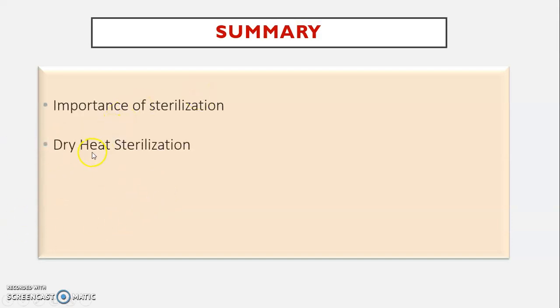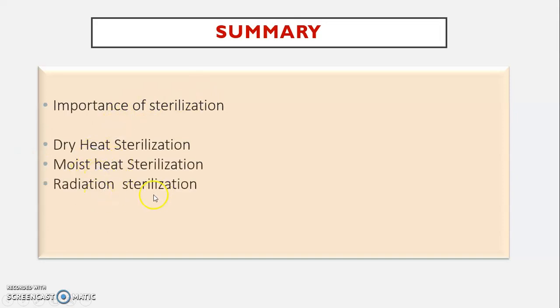In this session, we covered the importance of sterilization and in that dry heat sterilization, moist heat sterilization, radiation sterilization. In this session, we learned about the physical sterilization.